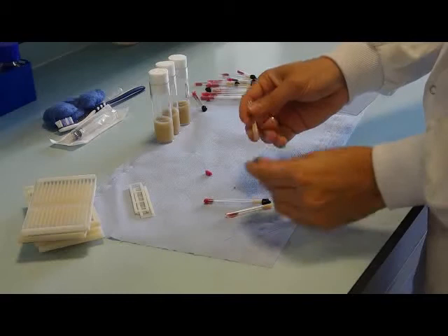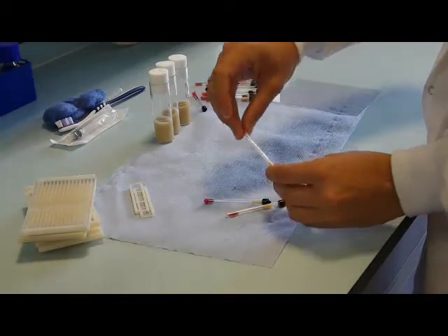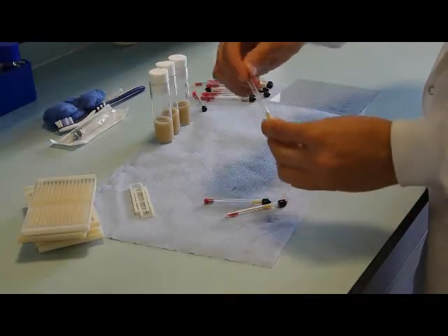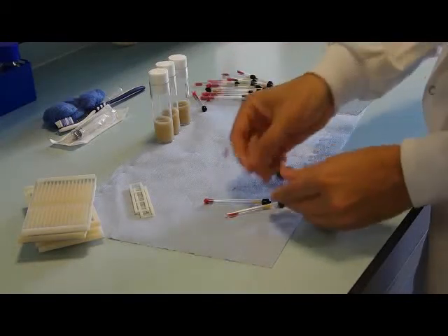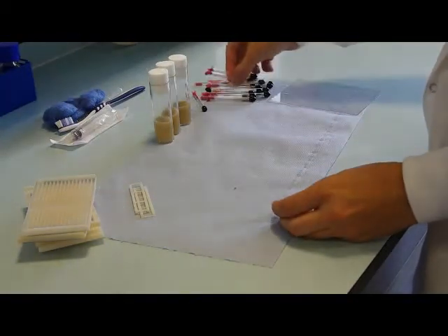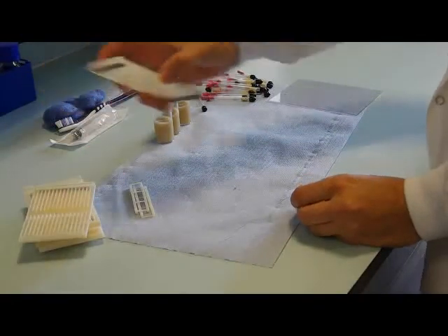Cleaning used tubes and preparing new ones can be very tedious. Preparing a bunch of 100 tubes can easily take several hours. For this reason and others, we decided to adopt custom made arenas instead, obtained using 3D printing technology.